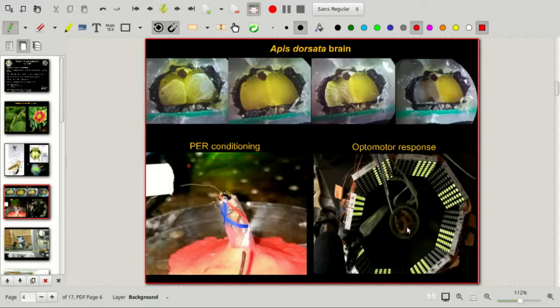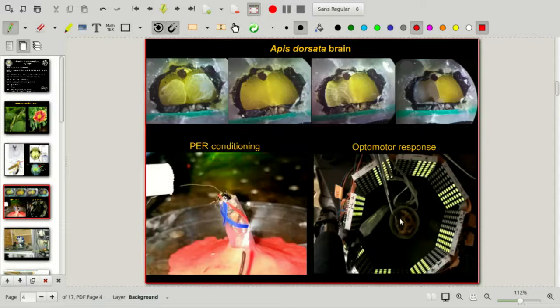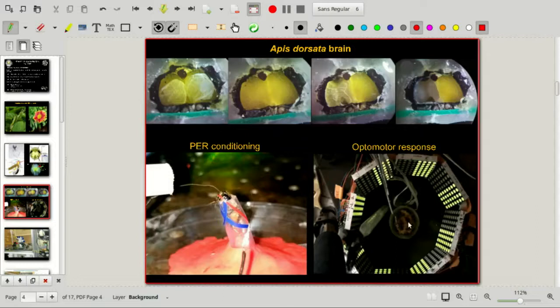Here is an optomotor response system. There is a ball on which a bee is standing, tethered by the thorax. A sensor monitors the motion of this ball, which is floating in air blown through a tube. You can do multiple kinds of experiments — some closed loop, in which the bee moves the ball and a controller changes the light in response, making the bee feel a certain rate of change in the environment. Or it may be open loop, simply applying a stimulus in a certain way and monitoring what the bee does in terms of walking.